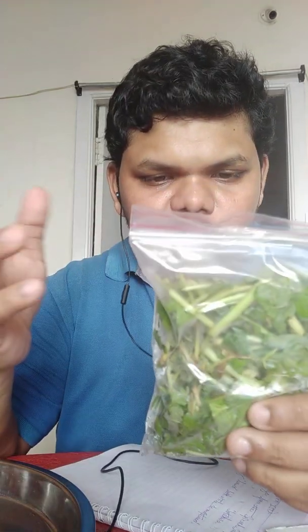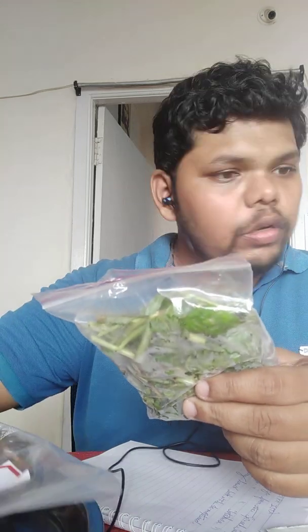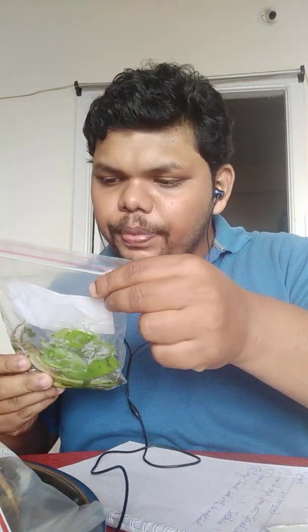Okay, so what we're going to do is refrigerate everything else except the spinach samples. Or what we can do is use the mint as a test. Let's use the mint as a test sample. Let's calibrate the process. So okay, I have decided to use the mint as a test sample, and I will put back the spinach in, start my test.